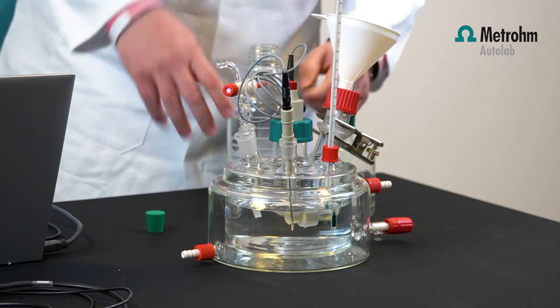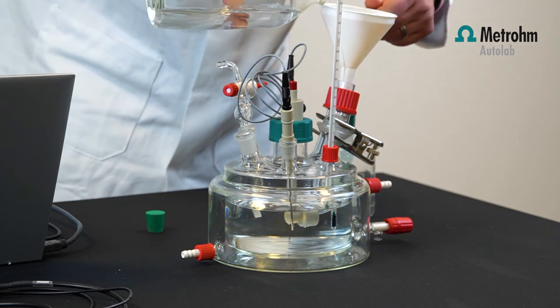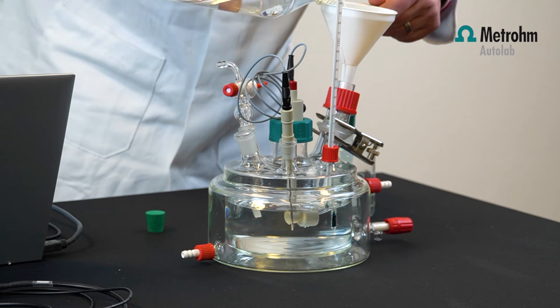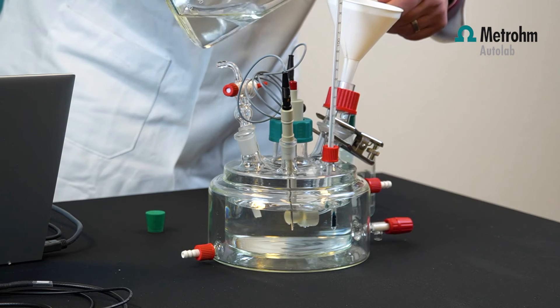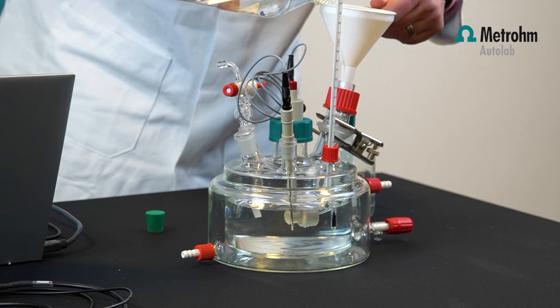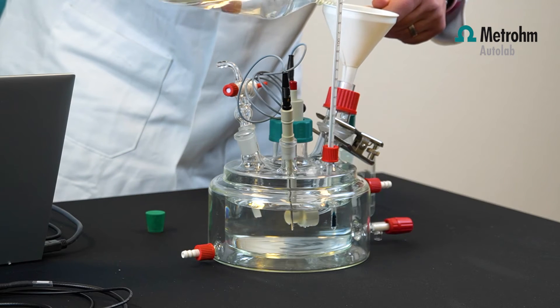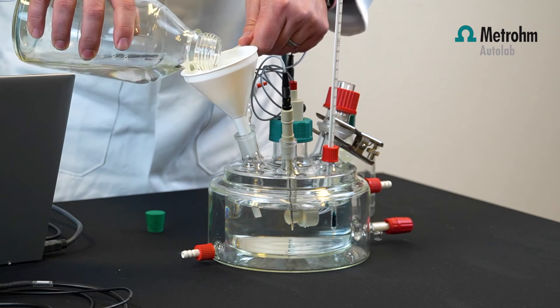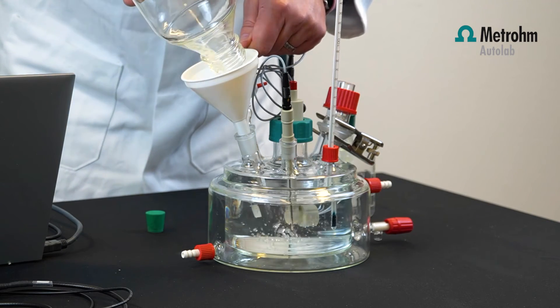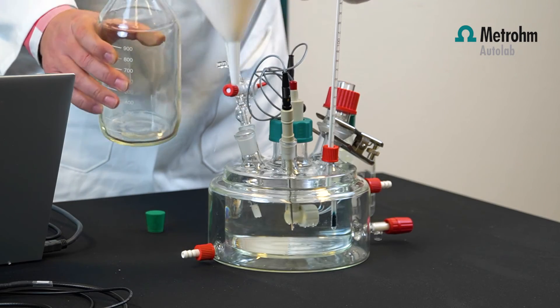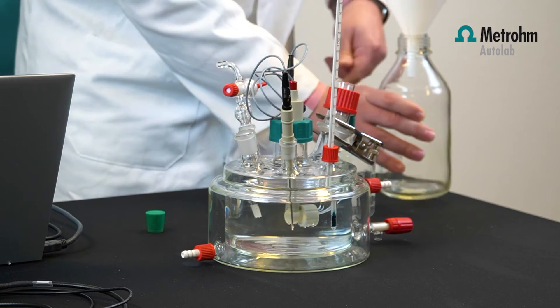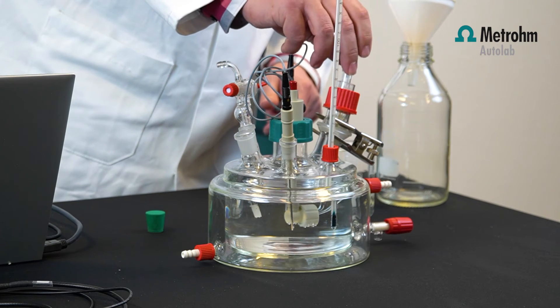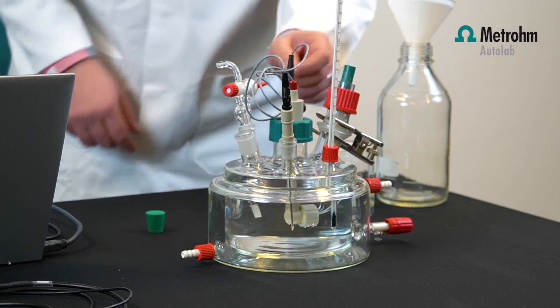Next, fill the Luggin capillary as well. Be sure that the Luggin capillary is below the surface of the water level. You need to be sure that the working electrode is low enough and the Luggin capillary is underneath the water level. Fill the Luggin capillary. After we put the reference electrode in, the rest can go in the corrosion cell.